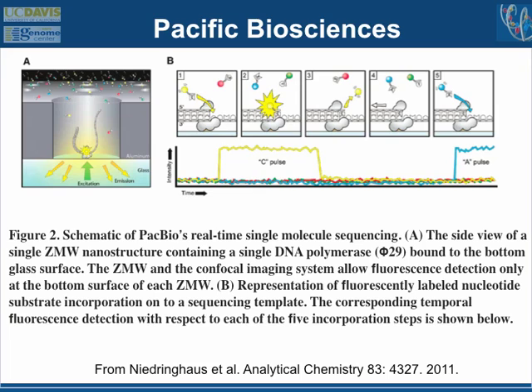And one thing that's really important about this method, it's watching in real time as this polymerase copies DNA. You can actually use it, instead of for sequencing, for studies of enzymology of polymerases. And a lot of people are starting to use the PacBio system for studying the kinetics of different enzymes. You can also use it to look at modified bases. So methylation slows down the DNA polymerase. And so for epigenetics, you can use the timing of the sequence output to tell you whether or not some piece of DNA was methylated or damaged with, say, UV radiation.